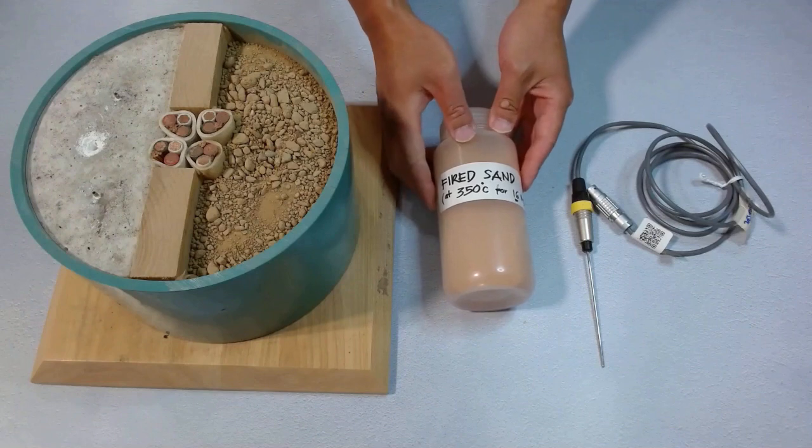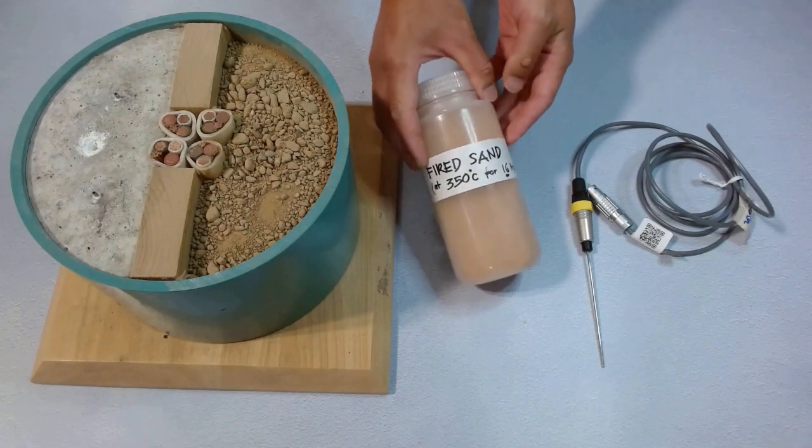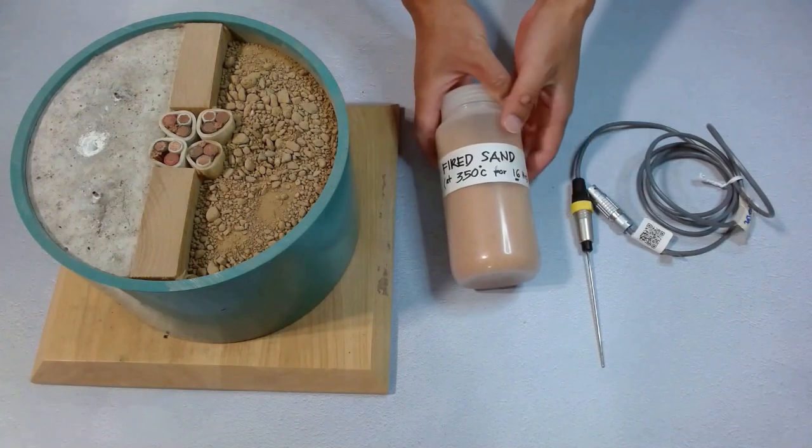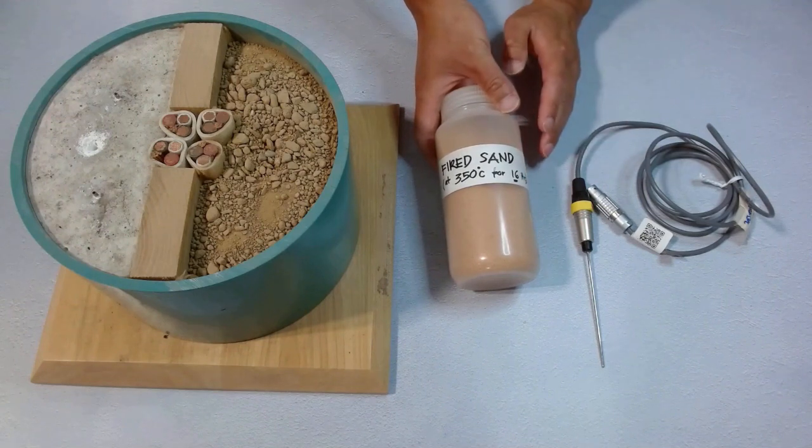Now we have an easy case of using the TLS100 sensor. This is fire sand. It is low in moisture, it doesn't have any pebble or rock in it, so the needle can go in and out pretty easily.